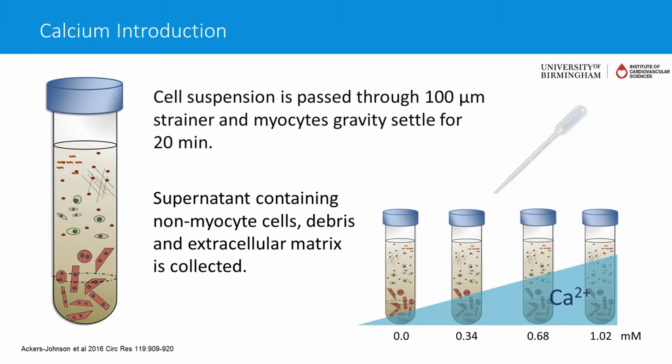Yes, I fully agree. Actually, I want to comment on sedimentation time. If the cell prep is good, cells will settle pretty readily. I don't have the timing off the top of my head, but they settle quite fast. For those that settle too slowly, or in fact too fast, both are no good.